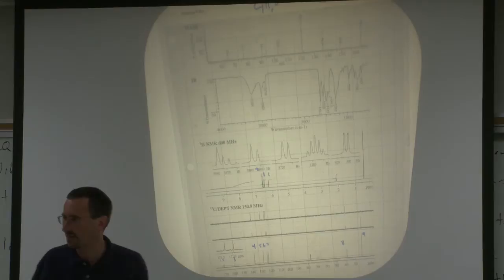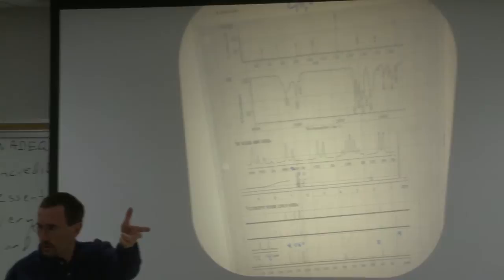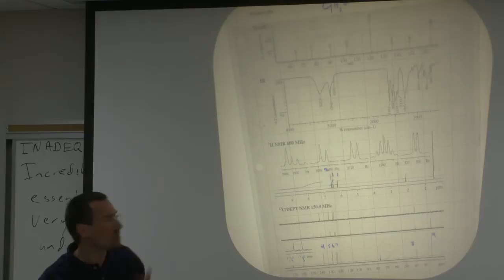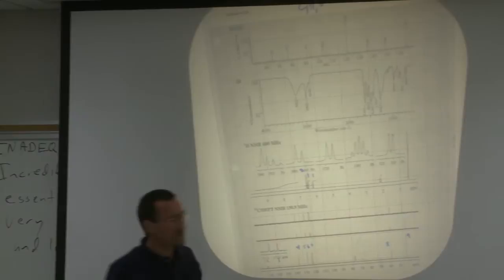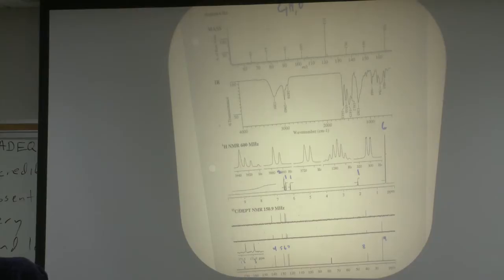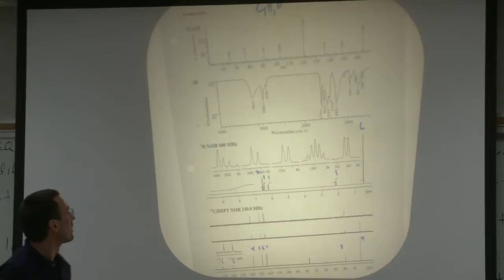But if you're being lazy, you can say, okay, because otherwise you're putting all that weight on 1.7. And if the 1.7 is really 1.5, then you come to a peak that's like 9 hydrogens. And that error of 10% is going to make your 9 hydrogens be 10 hydrogens or 8 hydrogens. But if you're pretty good here, you probably can get away eyeballing it as one and 6, right? So you're probably going to be well on your way to a molecular formula here.